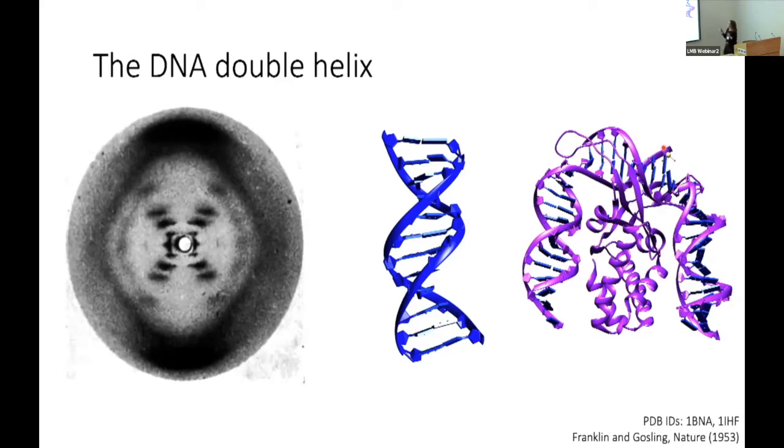But there are questions there which really speak to me, which say, is it the gaps that allow the protein to sit there, that allow the crystal to form? Or is it the gaps that allow the DNA to pack? And you get into a chicken and egg conversation saying, what came first, the defects or the binding? What came first, the interaction or the changes to the structure? And we are really interested in how the structure of DNA affects all of its interactions.